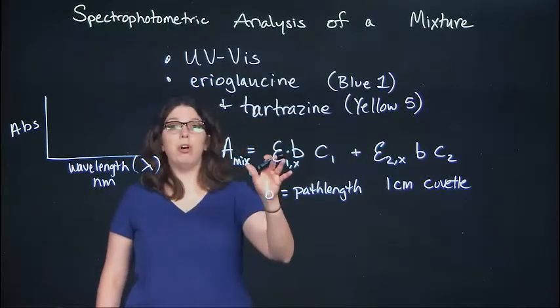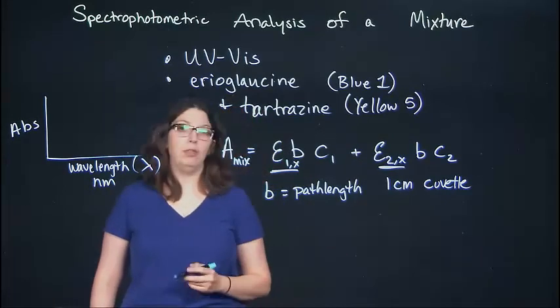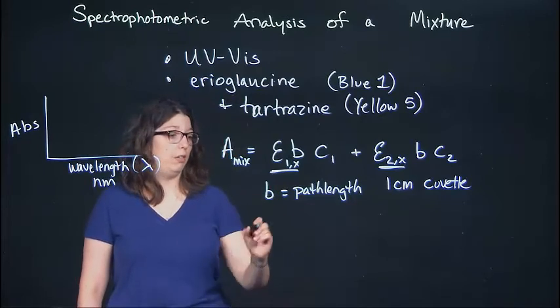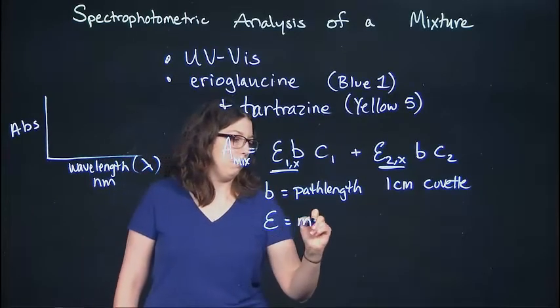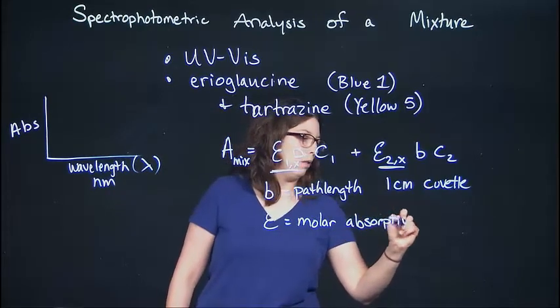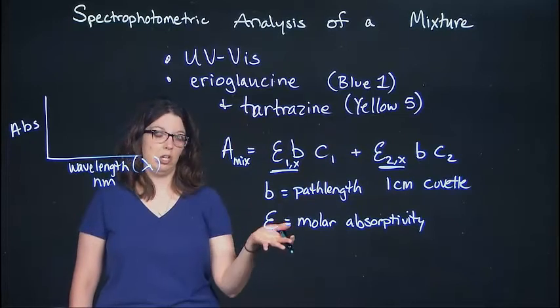Now, we don't know the molar absorptivities of the 2 components at these particular wavelengths. So this is something we're going to have to determine. And that's actually quite easy to do. We can use Beer's law to determine that.